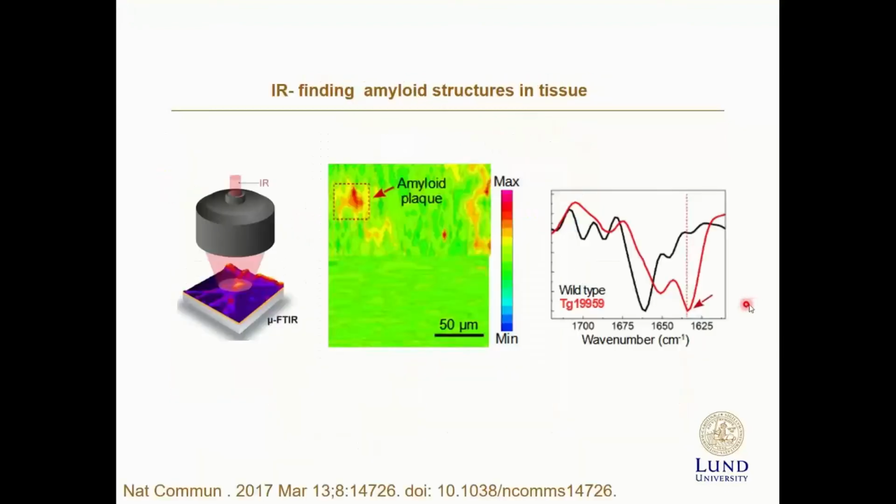So what we specifically show is that changes in brain tissue that can be detected by infrared precede changes that can be detected by other techniques. This was a very important discovery: amyloid plaques in brain tissue do not appear like popcorn.